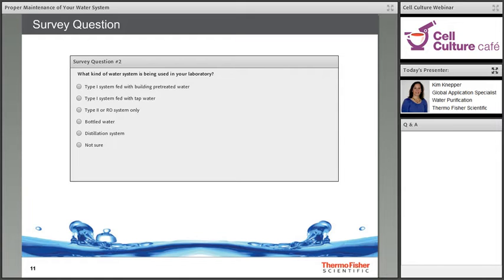Okay, Kim, I'm going to broadcast the results and turn it back over to you. Thanks, Megan. So I see that most of you have distillation in your lab, which is great. And then more commonly is also the type 1 system with a pre-treated water. And there's quite a few of you that are not sure. So this might be a good opportunity to find out what kind of water is feeding your lab. And then some of you are using a mixture of type 1 with tap water or type 2 and RO water.